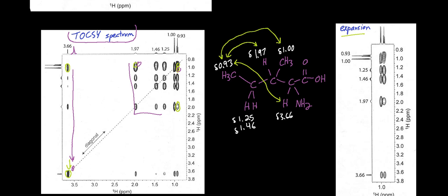So you end up being able to fish out the two separate spin systems, starting with this information, or really, when you think about it, any information from any of the signals that are well resolved. So there's a good chance there'll be some other signals that are well resolved, but really in this region, especially for peptides, it's going to be a really crowded mess. But the ones that are distinct will allow you to fish out some, if not all, of the ones that are overlapped in the other parts that are overlapping.